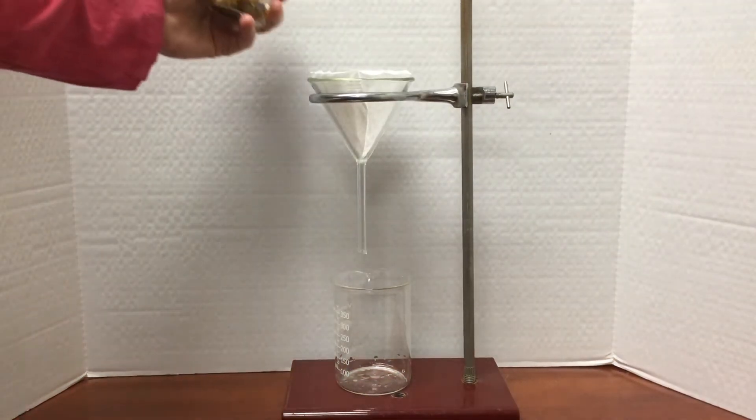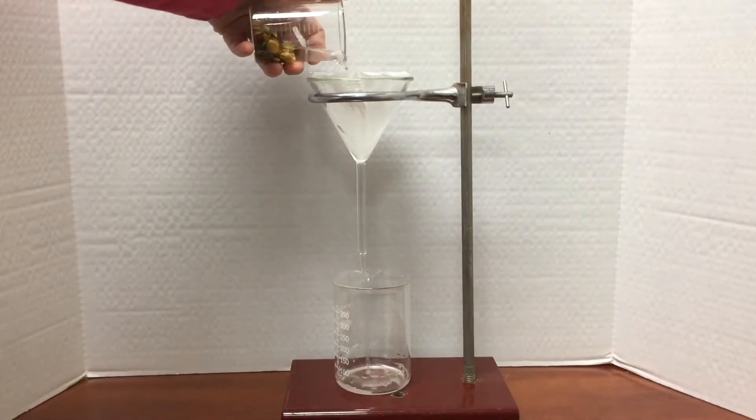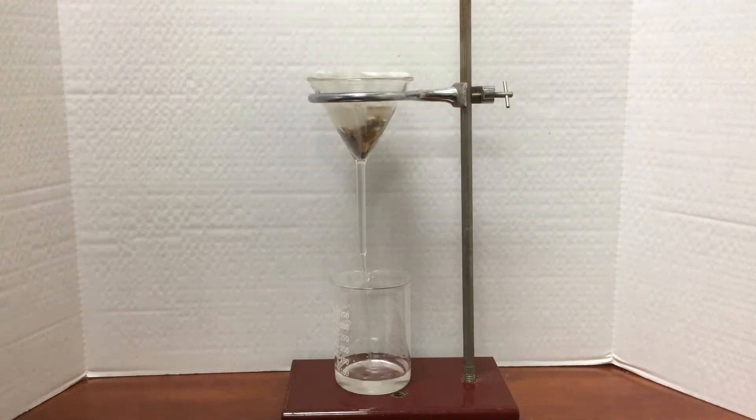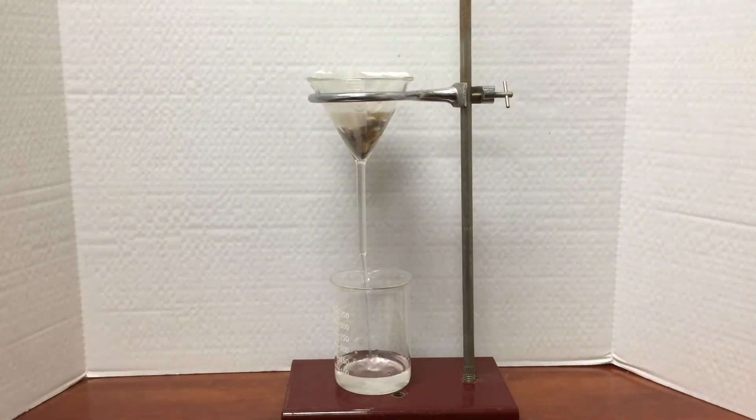Here I pour the mixture through a paper filter. While we normally use paper filters to filter out smaller insoluble solids like sand that are too small to be caught by a strainer, paper filters can be used to separate any insoluble solid from water.